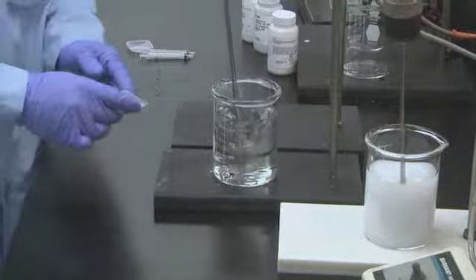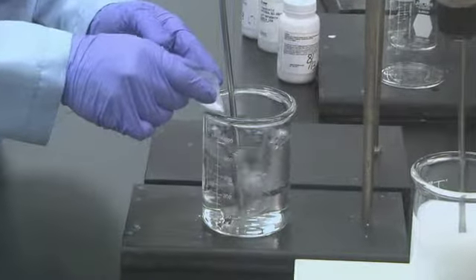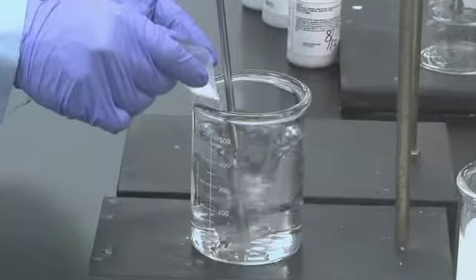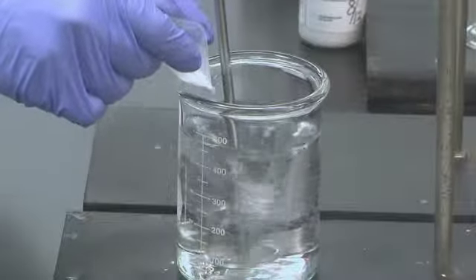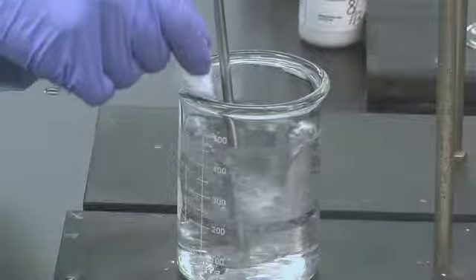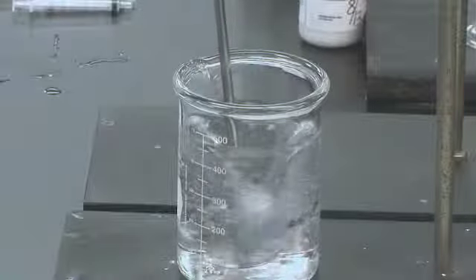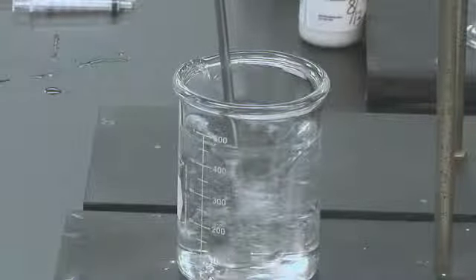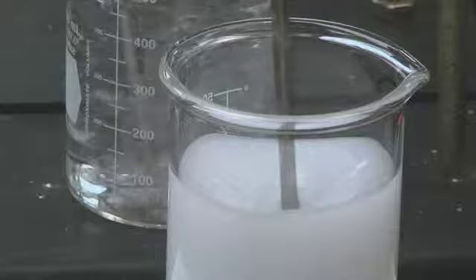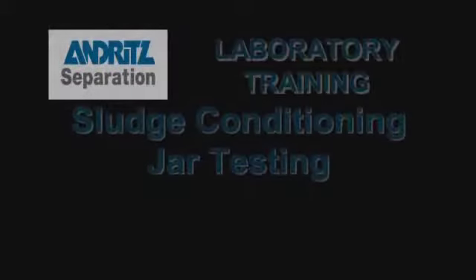Examine the solution for solubility and polymer accumulation on the mixer. No chunks of polymer should settle to the bottom of the beaker. Finish mixing for approximately 15 minutes. Age for 20 to 40 minutes before using.